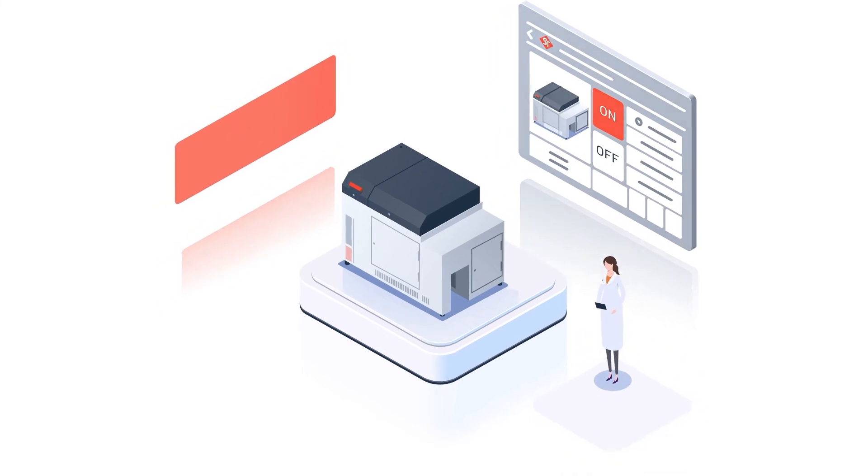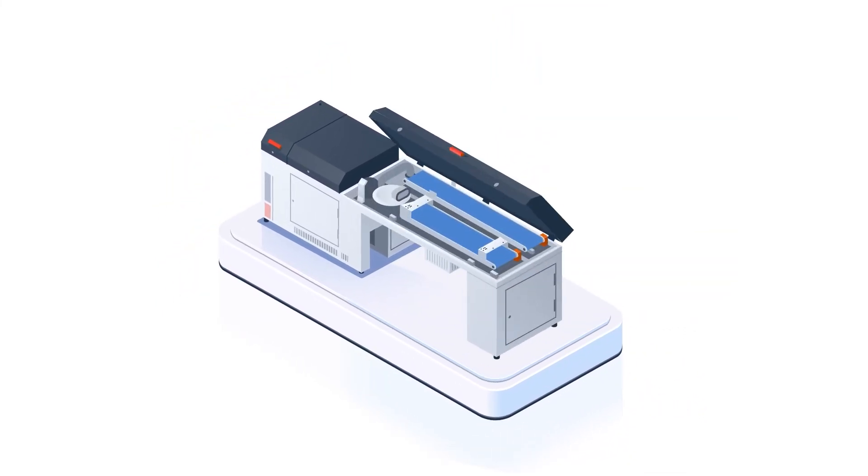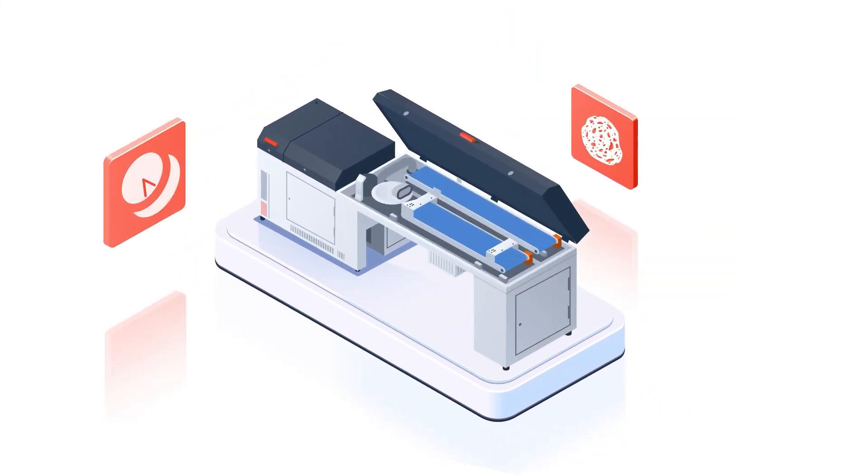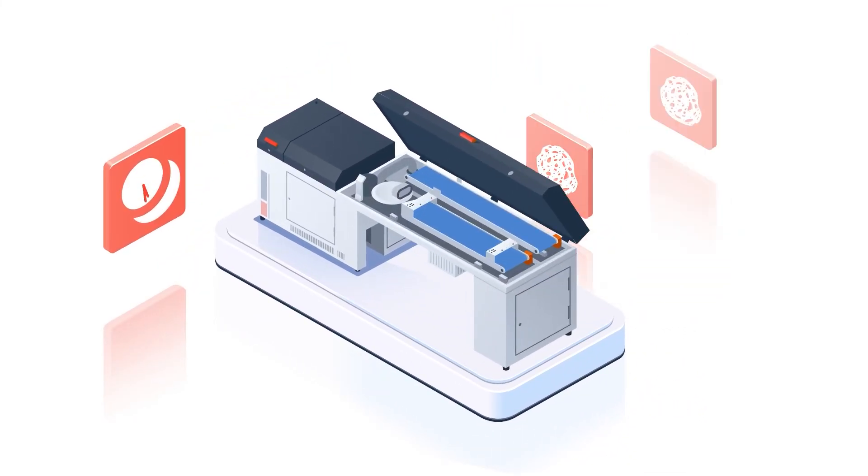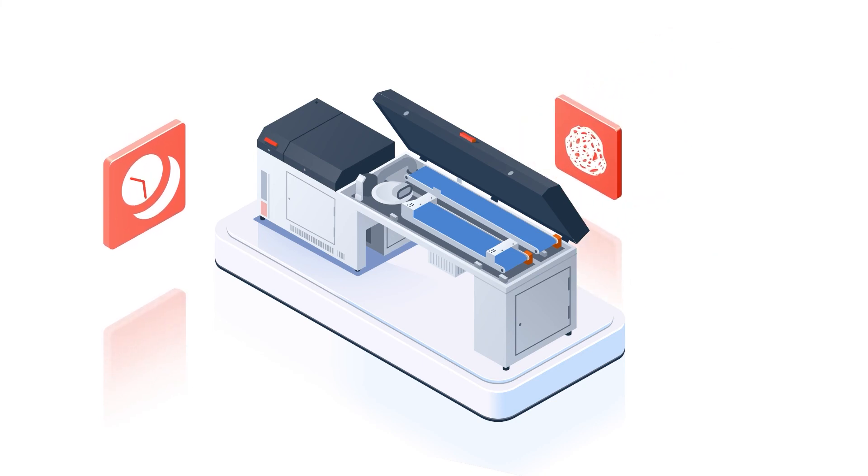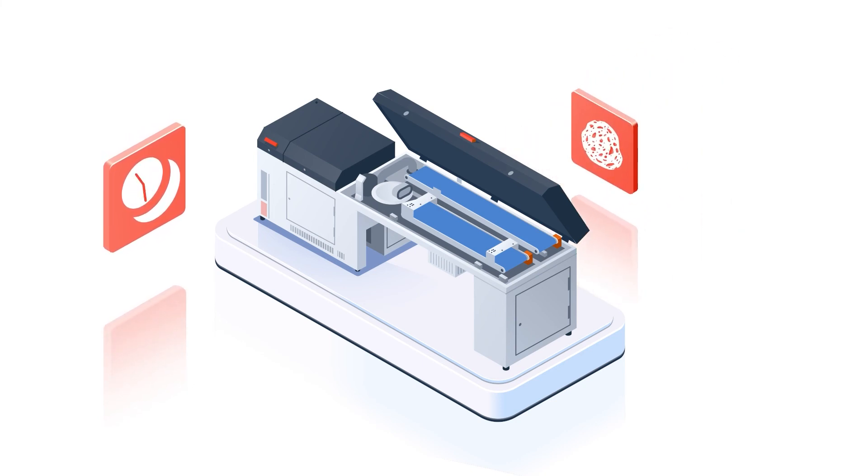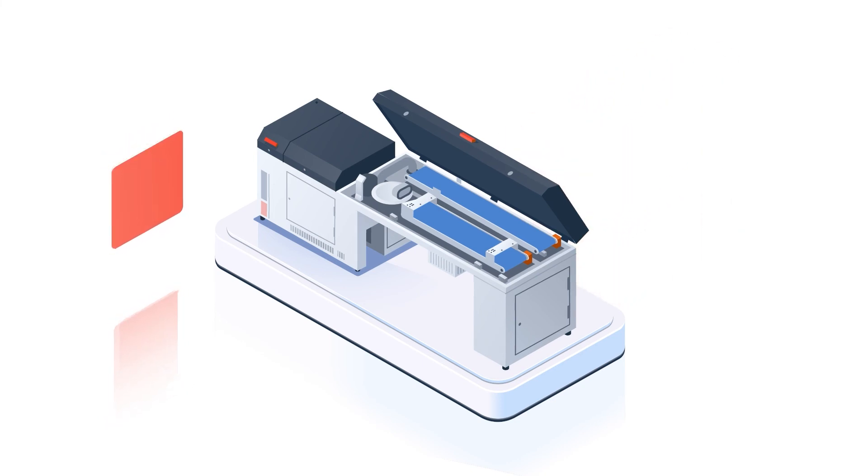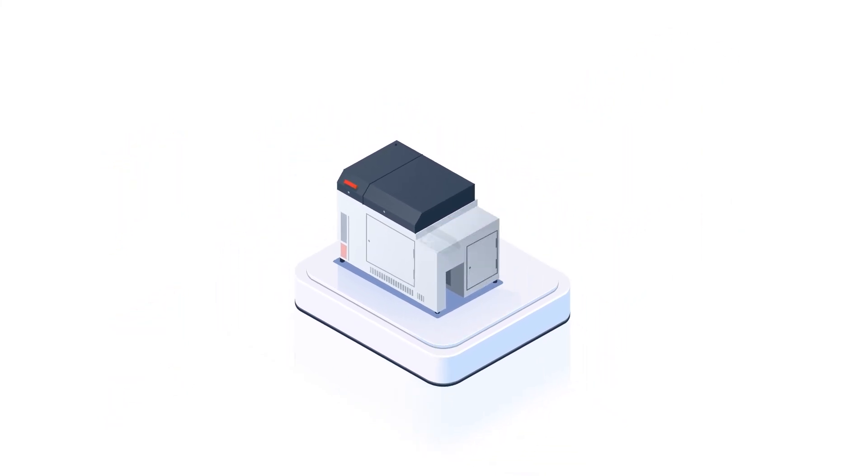When the number of samples is high in the lab, they can also be analyzed via a connected sample magazine outside laboratory hours.